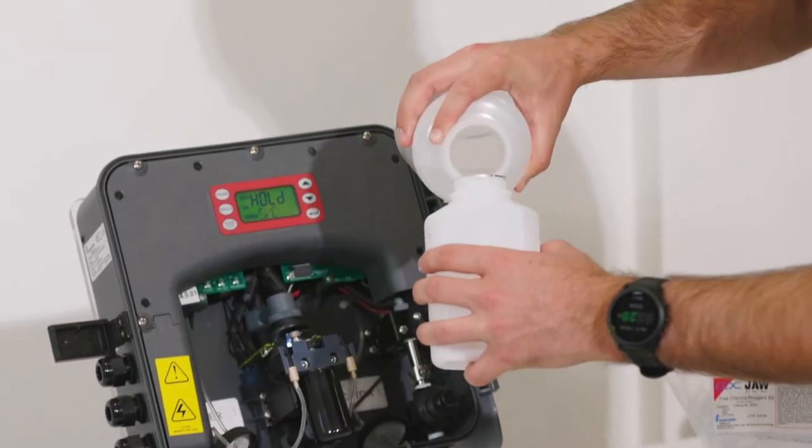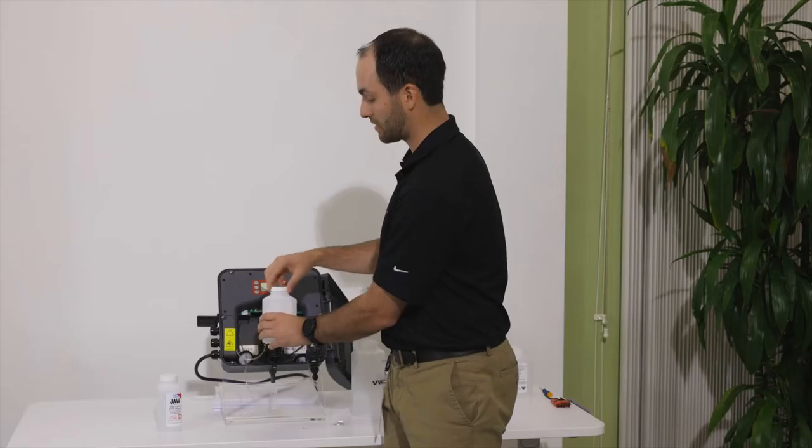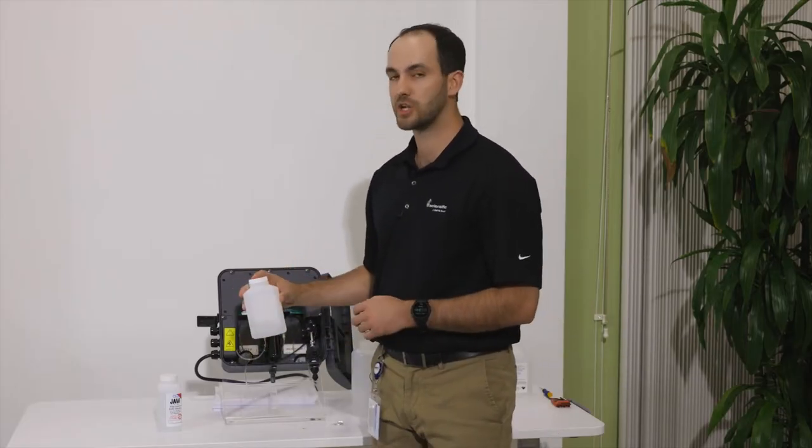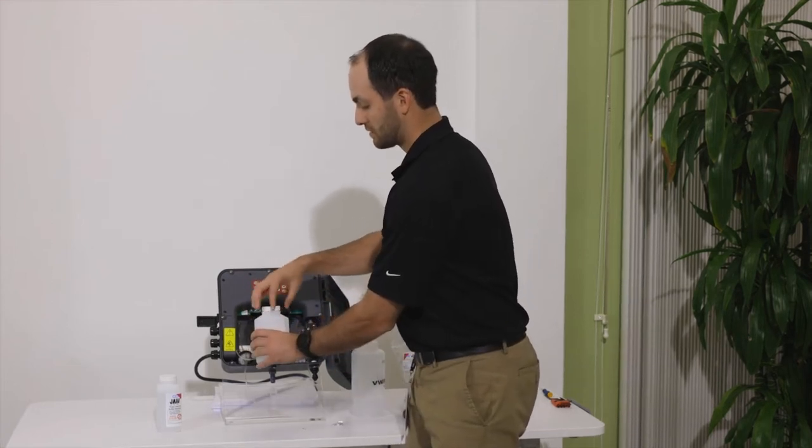Take your DI water. We'll fill our indicator about a quarter way. Put the top on and we'll invert it very gently. Again, no need to shake this too vigorously.